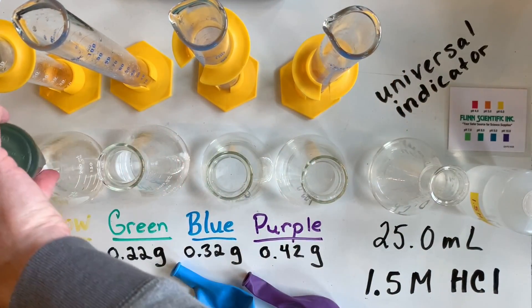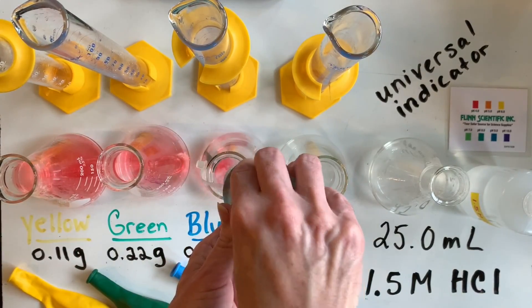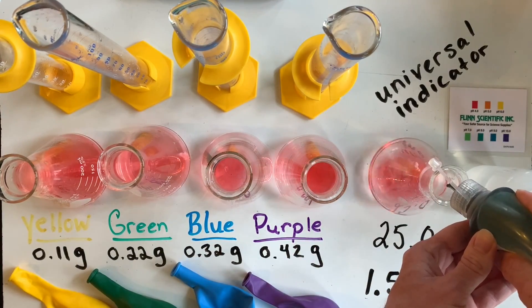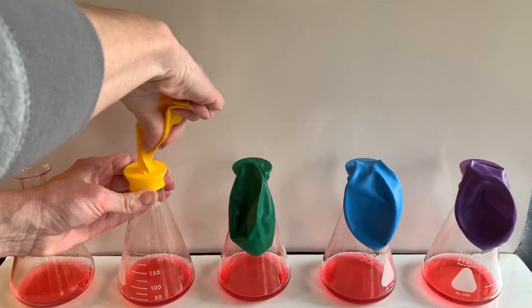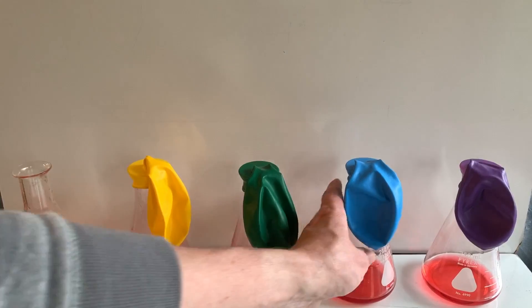Universal indicator was added to help us determine which reactant is limiting or in excess and how much of that excess reactant might be left over. The magnesium is dropped into the hydrochloric acid from inside the balloons in order to start this reaction.